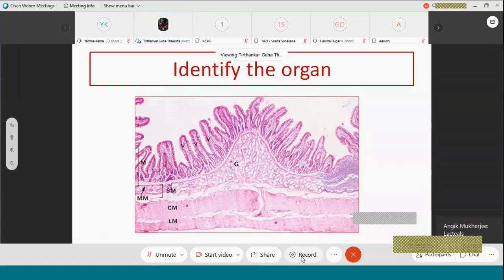One who said lymphatic, it's well tried, but it's a fibrous structure. You can see it's a thread-like structure. Multiple thread-like things are coming down. It is not a hollow structure. Yes, it is a nerve. It's one of the enteric nerves.